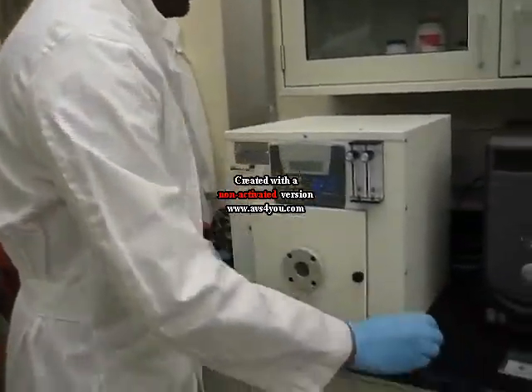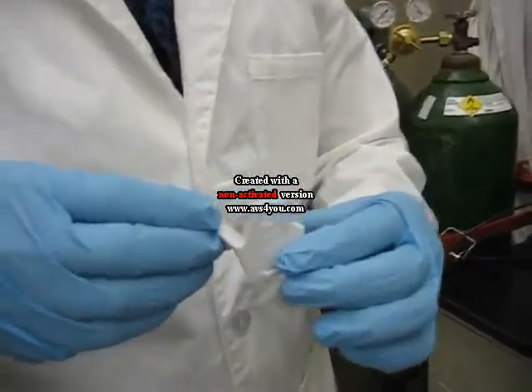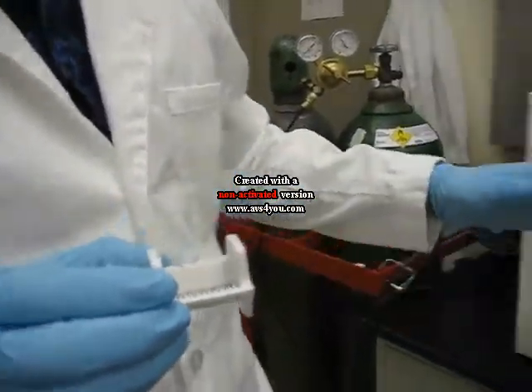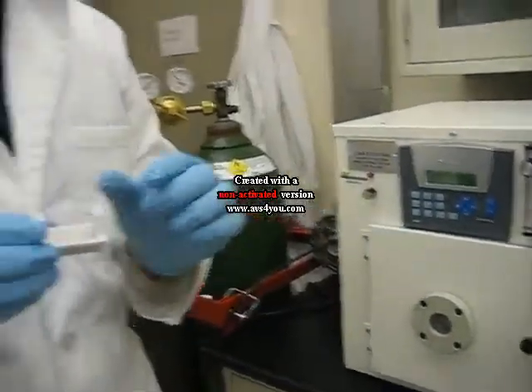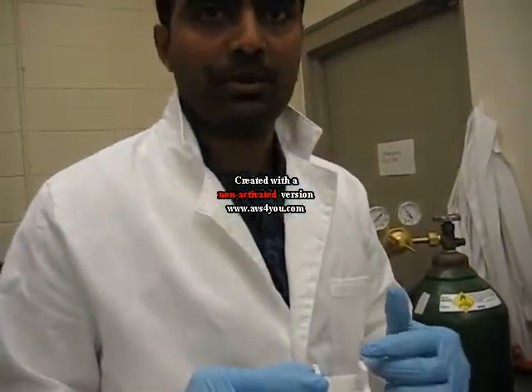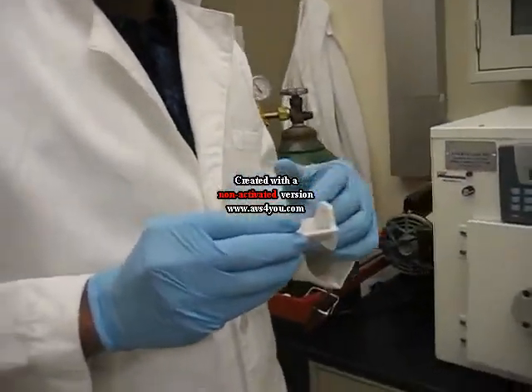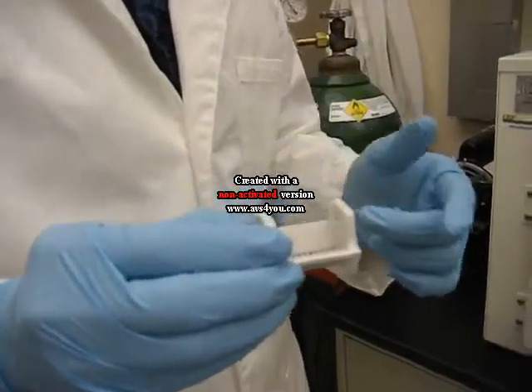We've loaded these glass cover slips onto these boats here. We use this Plasma HPE50 machine to clean the glass cover slips of any organics or fingerprint oils, so that we can use the cover slips for beam evaporation of metals. We get thin layers of titanium and gold on these cover slips.